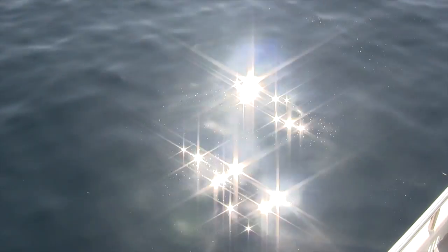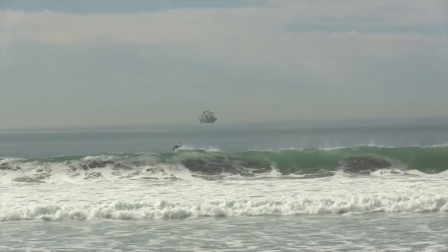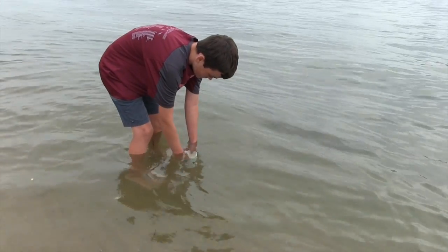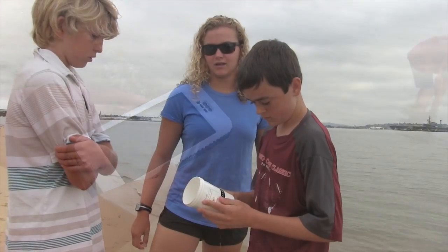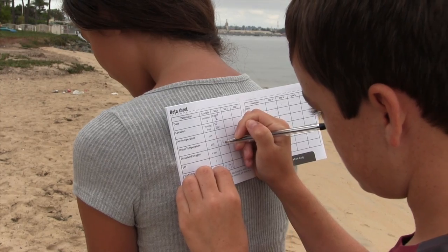Temperature measures the warmth or coldness of the water. This indicator is important because it affects dissolved oxygen, photosynthesis, and the food supply. Waters that are too hot or too cold can have severe effects on fish and other aquatic life. To test temperature, place the thermometer 4 inches below the surface for 1 minute. Read the temperature, the number with the green background. Record the number in degrees Celsius.